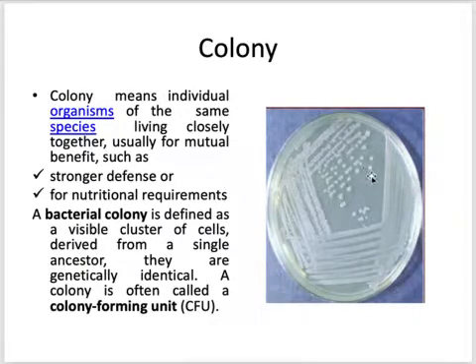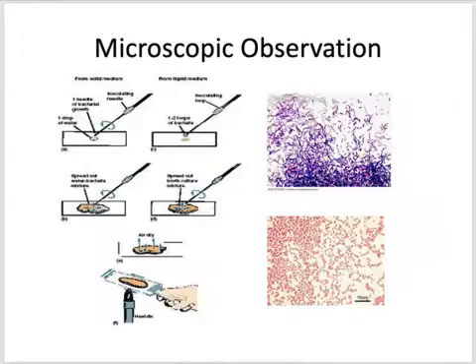Don't take too much, because the colony contains millions of bacteria. Then put that bacteria in the sample.